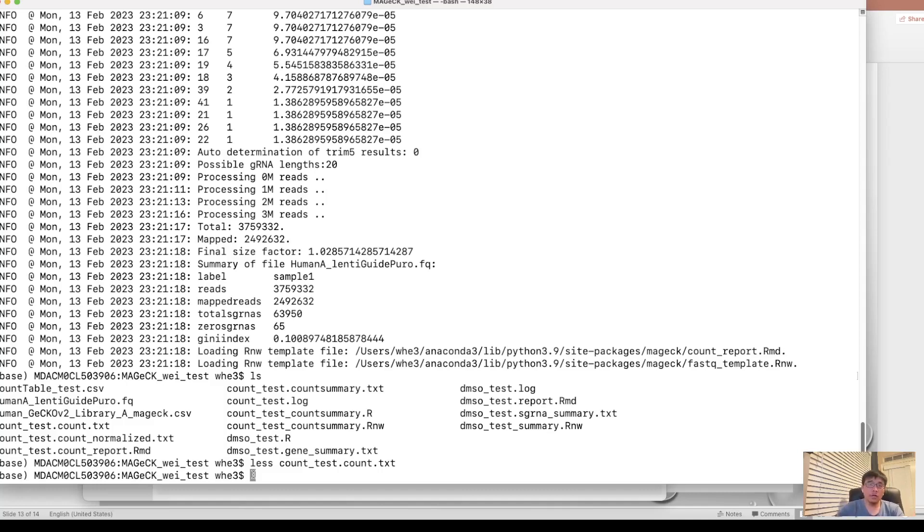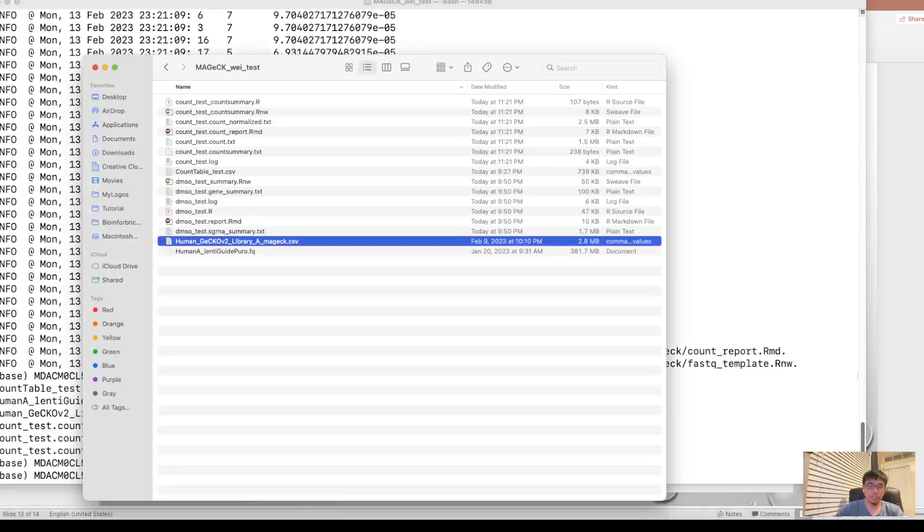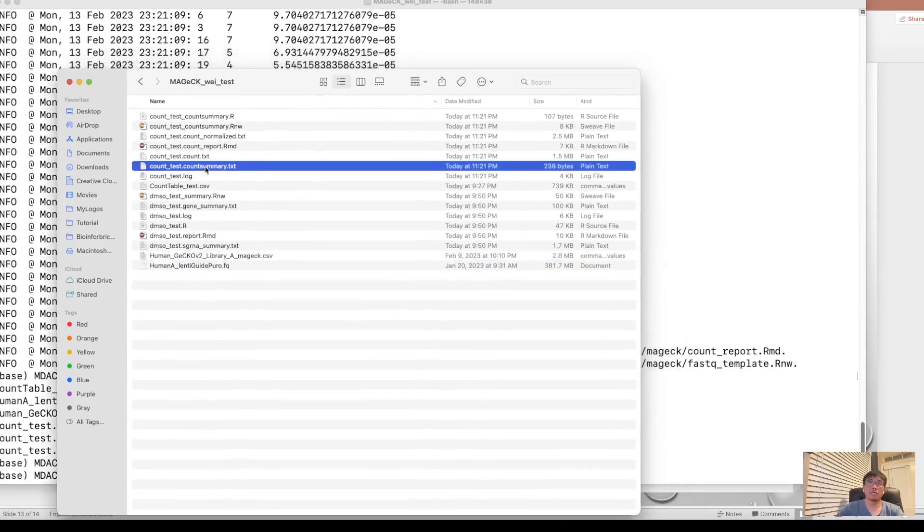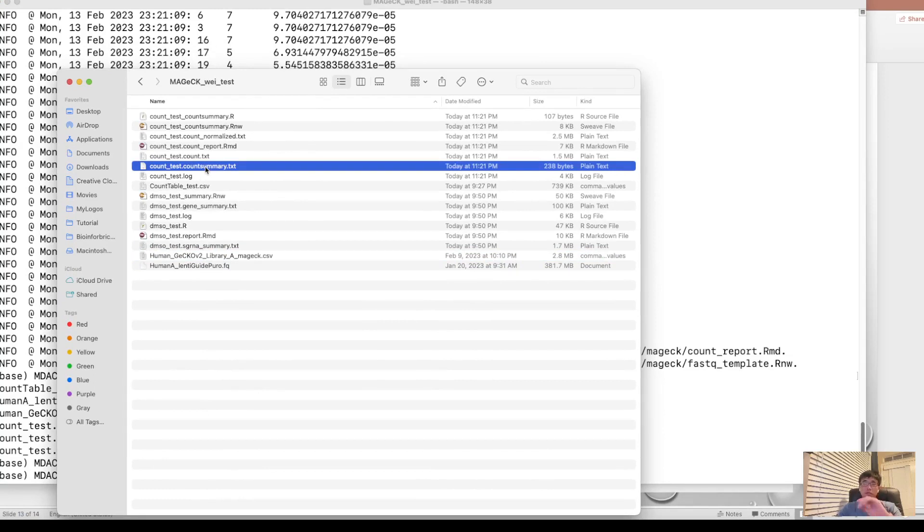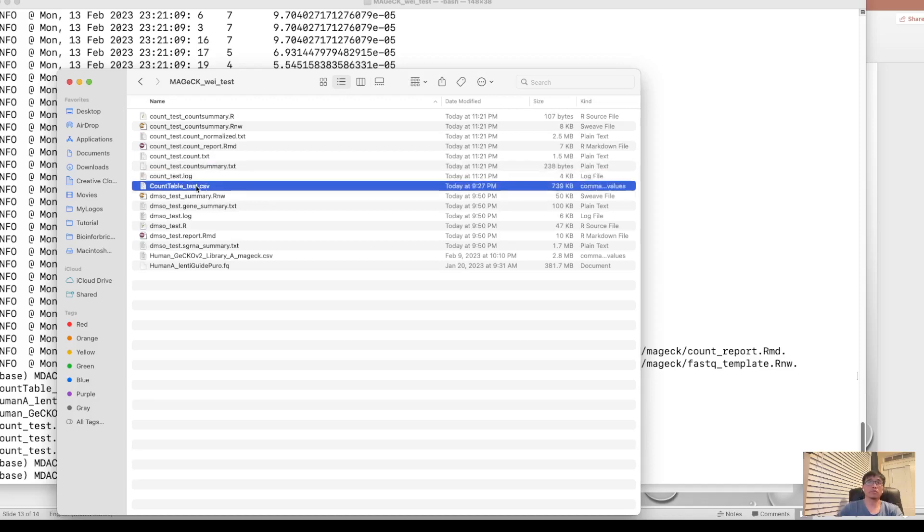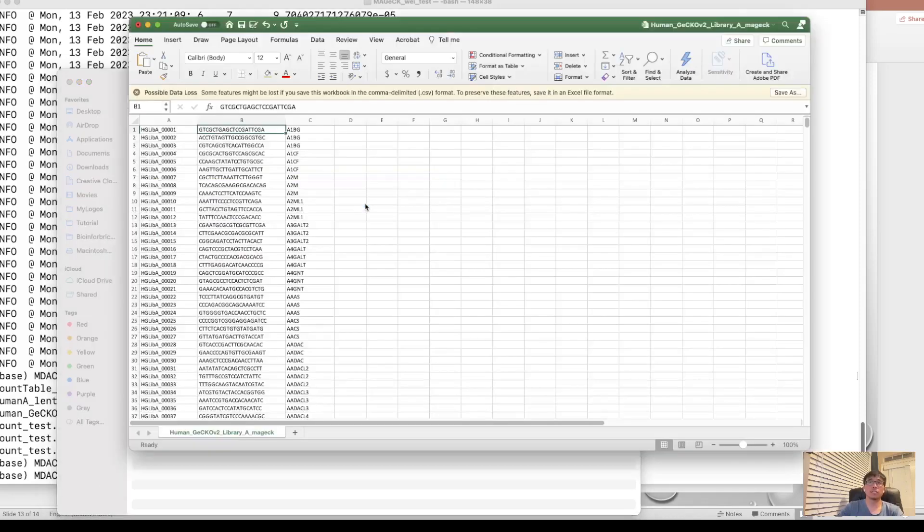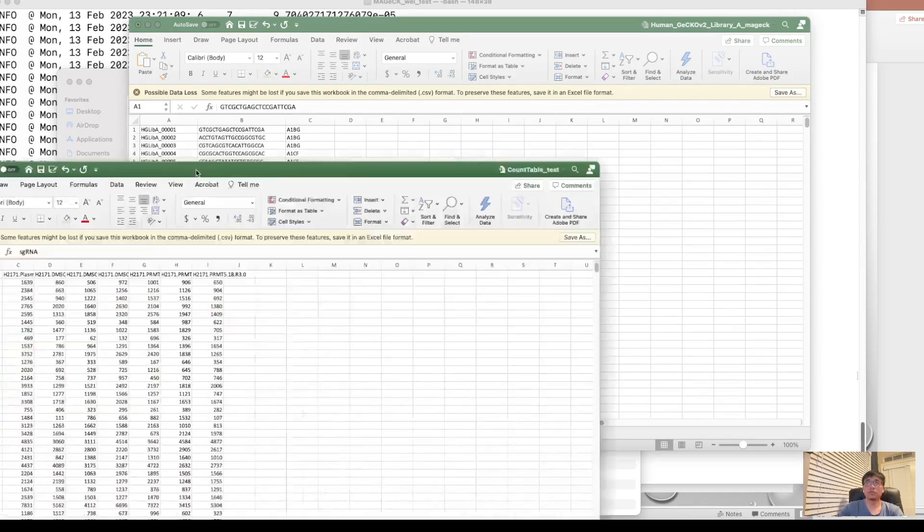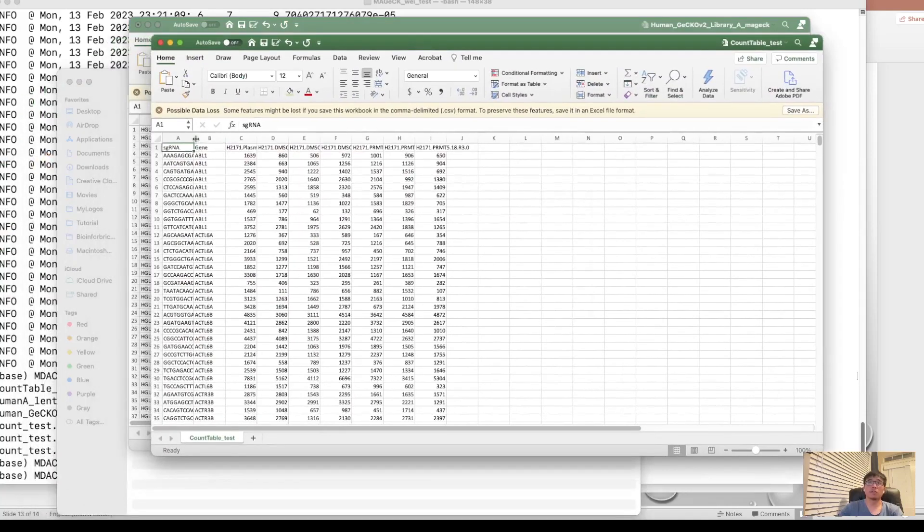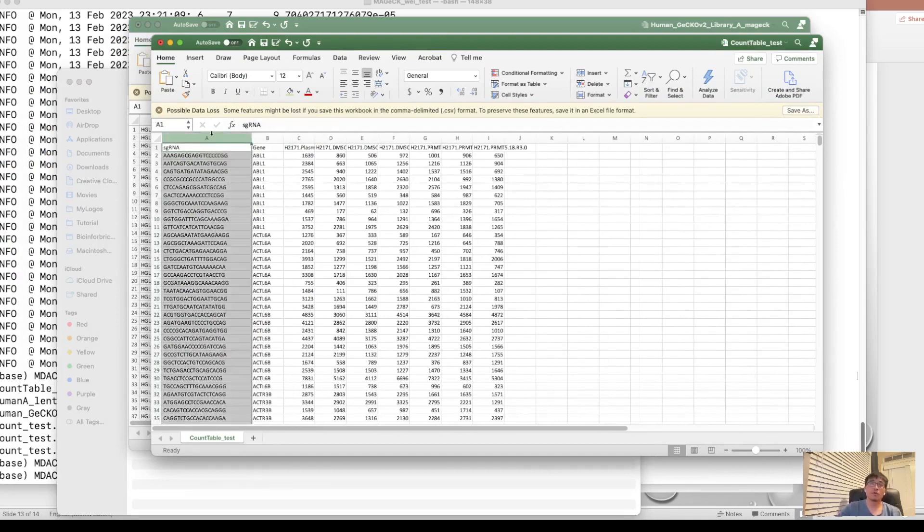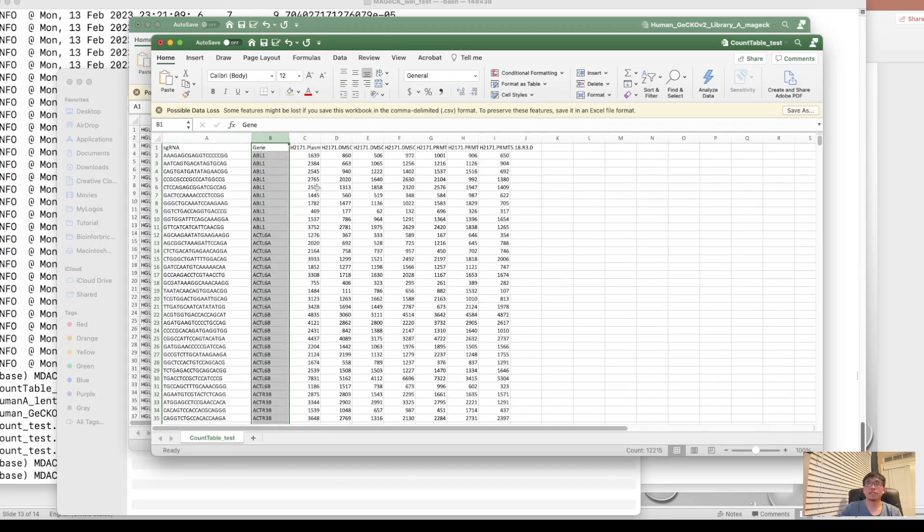So here I would like to, I just use the read count table from one of our studies published on Nucleic Acid Research to show you how to perform the statistic test. So this is our read count table. The first column is sgRNA. And the second column is the gene name. And these are read counts for each condition.